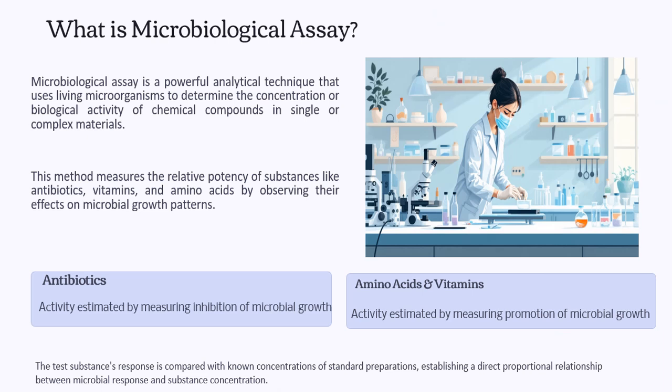It is performed to measure the relative potency or activity of substances like antibiotics, vitamins and amino acids by determining the average response of a microbial culture. Clear?